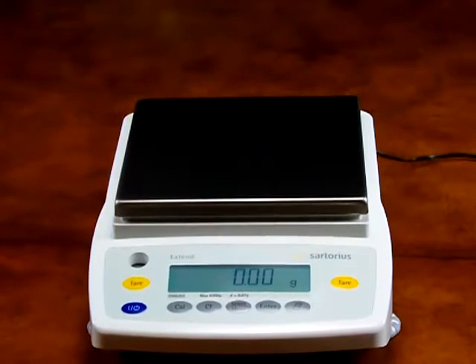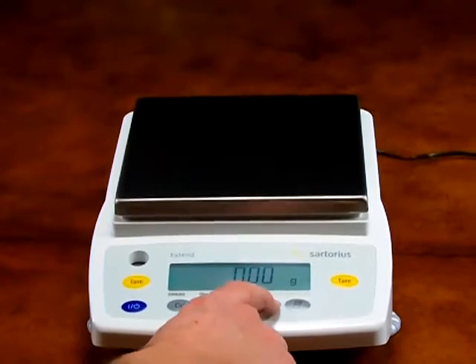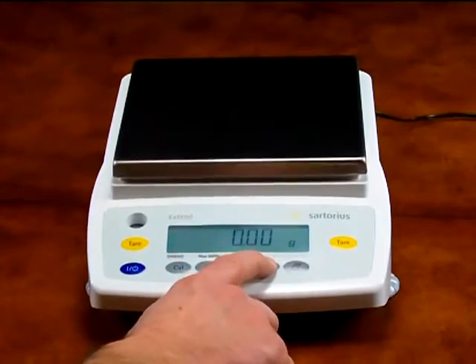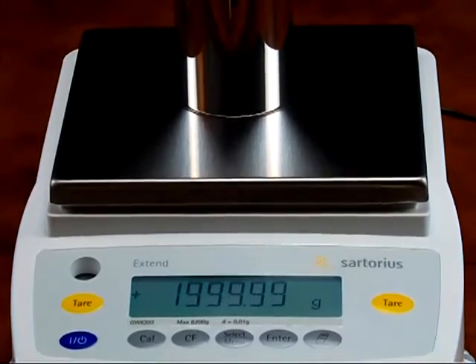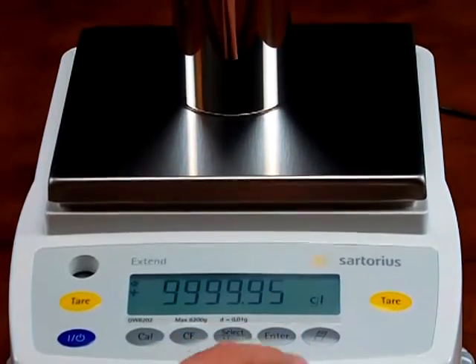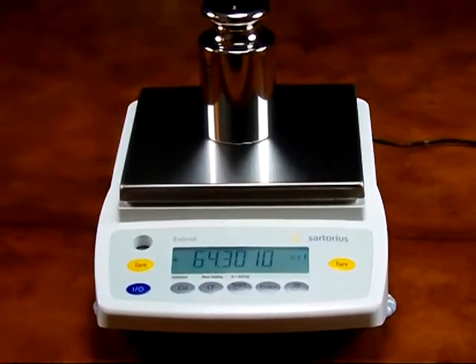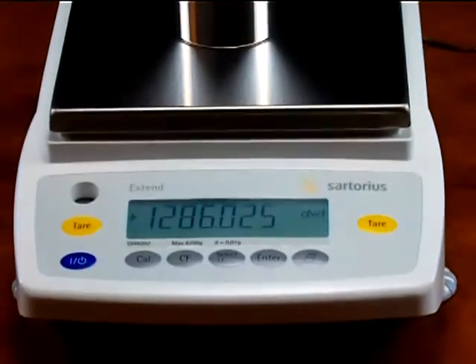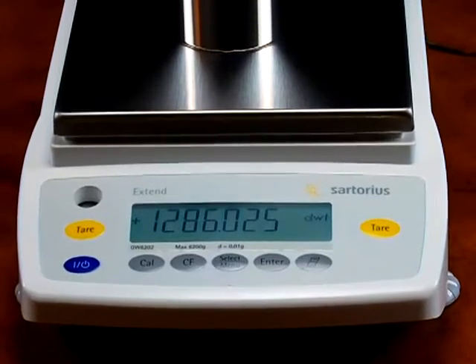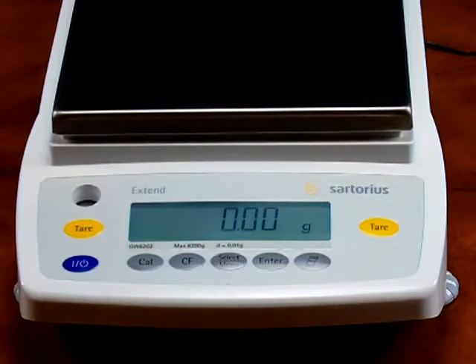Another wonderful feature of the GW6202 is changing the weigh modes. Simply press the enter button — we have the balance in grams at this time. Put the calibration weight on so you can see this. Press the enter button to change the weigh mode: we are now in carats. Another press scrolls to pounds, then troy ounces, and the fifth weigh mode is penny weight. You can configure the balance up to 13 different weigh modes. Now the balance is back in grams.